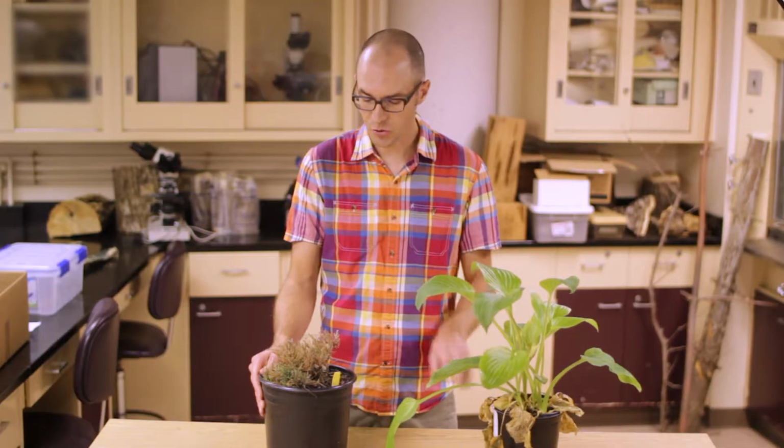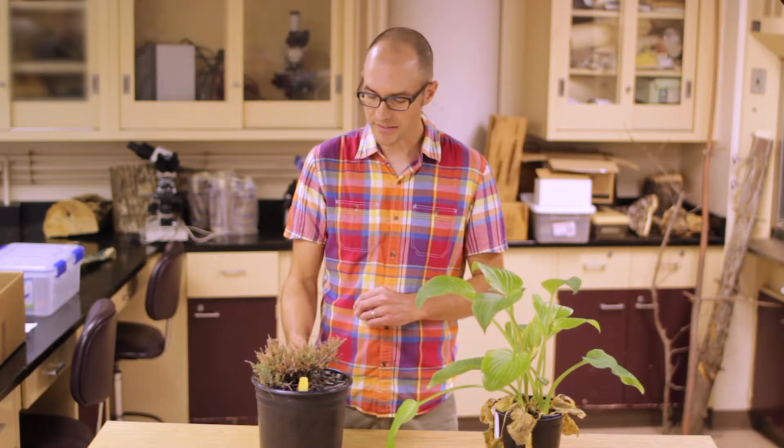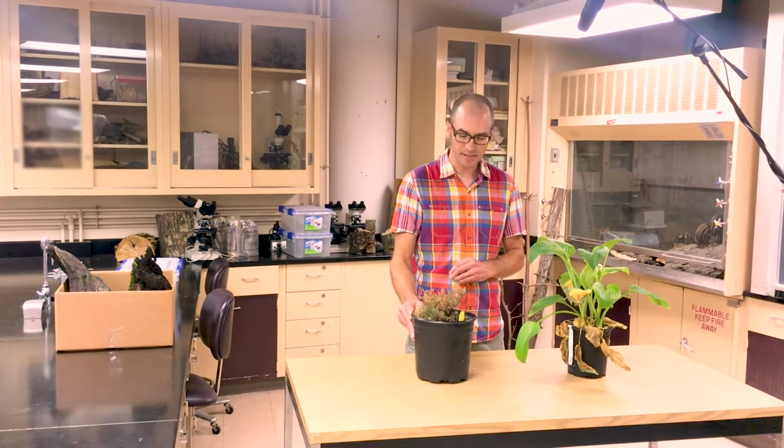And so of course these are two potted plants. These were brought in by hand to the clinic. That might not be possible for you. You might live too far away from the clinic, and so you want to mail in a sample. And so what I'd like to show you next is actually how you can mail in a whole plant sample and how you can package them in a way so that when they arrive at the clinic, we actually do have a high quality sample to work with.